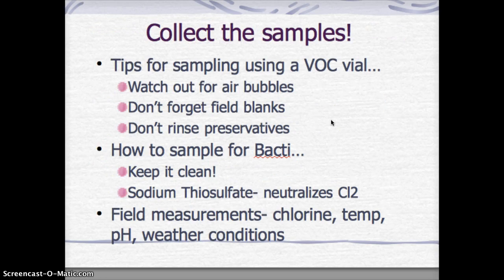Now, here are some tips for collecting samples using a VOC, volatile organic compound, vial. You want to watch out for air bubbles. This is the one where you have a bubble over the top, and you make sure there's no air in that at all. You want to have some field blanks, and you do not want to rinse out the preservatives that are there.